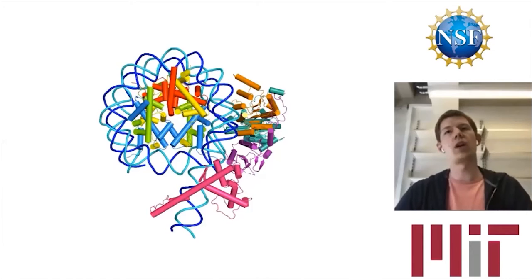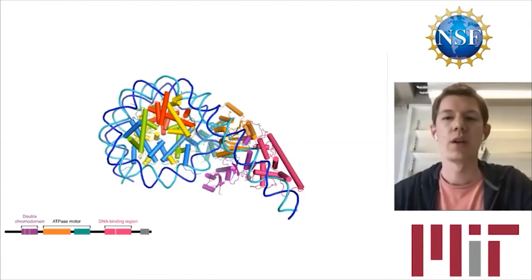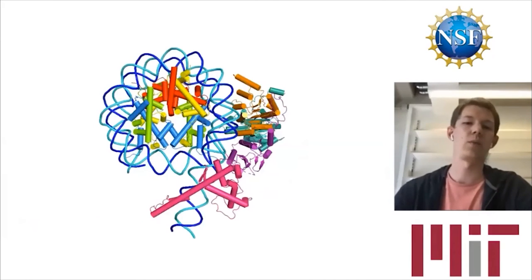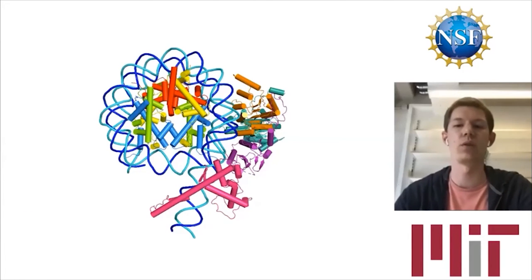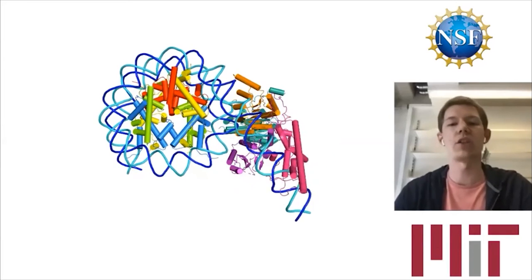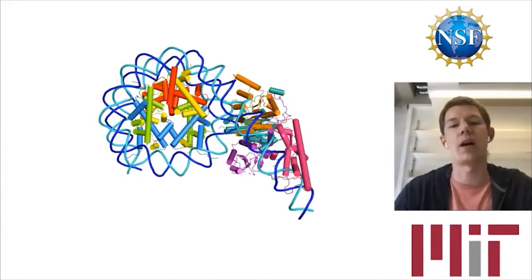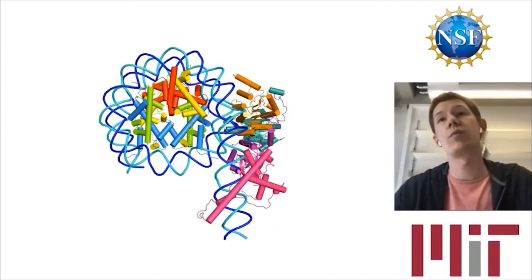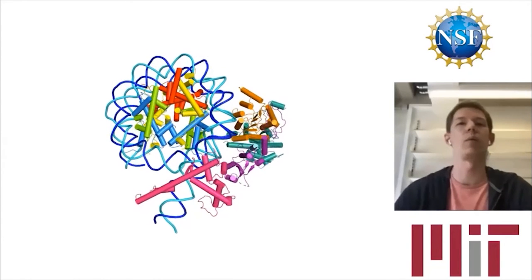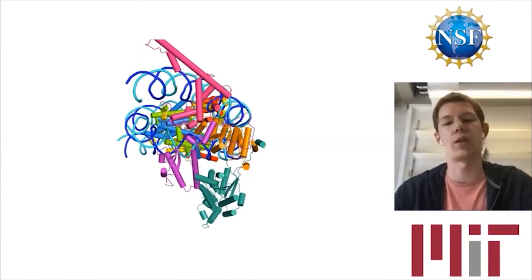And additionally, we also observe this quite dramatic unraveling of two full helical turns of DNA, which is stabilized by the DNA binding region. And to visualize this, we have modeled here a canonical nucleosome with extranucleosomal DNA, and we then morph to our structure. And I think you can appreciate the dramatic change the DNA undergoes quite easily. In fact, the DNA changes its trajectory by approximately 60 degrees. And this seems to be really a signature rearrangement of Chd1. And one can then speculate that this rearrangement probably destabilizes the nucleosome to allow for high efficiency once the tightly regulated process of remodeling takes place.